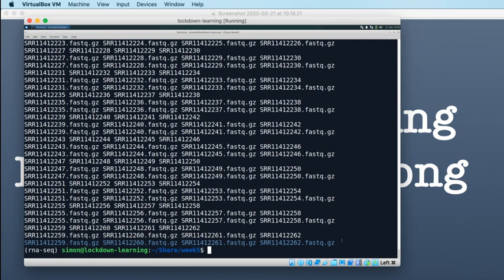and I know that there's a lot of messing about between various things in order to get there. And somebody said that this would be really easy to do in Perl, and I don't disagree. It would also be really easy to do in Python. That's what modern scripting languages give you the ability to do really easily. Bash is a bit more archaic and possibly in some ways a little more limited, but gives you access to these powerful command line tools. So I think we've done okay there.